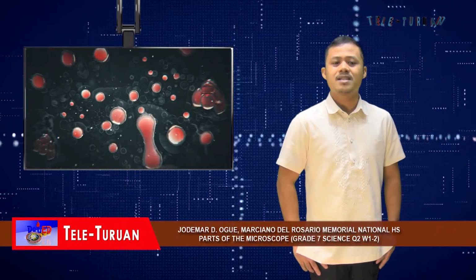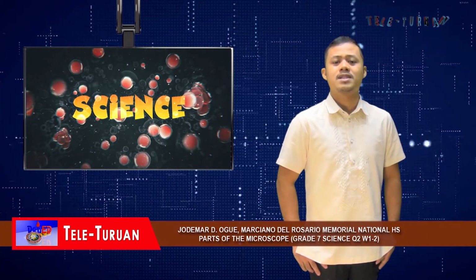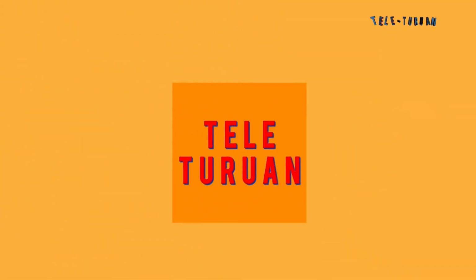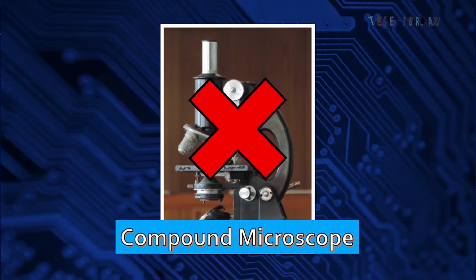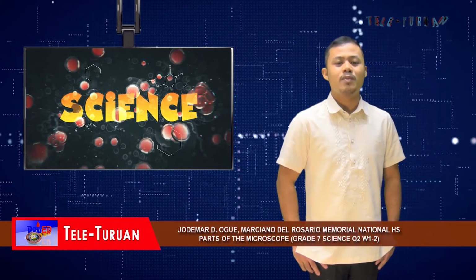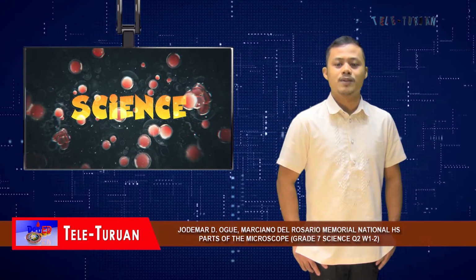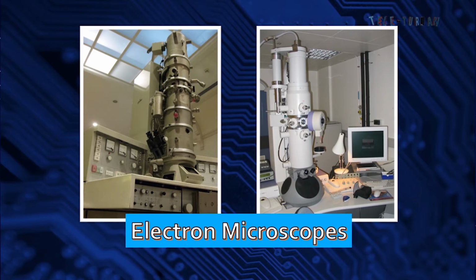We all know that these things and organisms are too small to see. How did they get these images? Right. They use microscope, but not this type of microscope. This is a compound microscope. We can enlarge the image of objects in this type of microscope, but not up to that magnification. To see objects up to those magnification, we need to use much bigger equipment, much bigger microscope. Like these. These are electron microscopes. They are much bigger compared to compound microscope, but they magnified up to 10 million times.